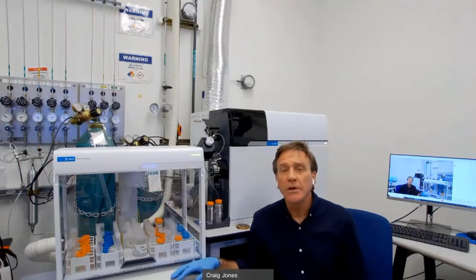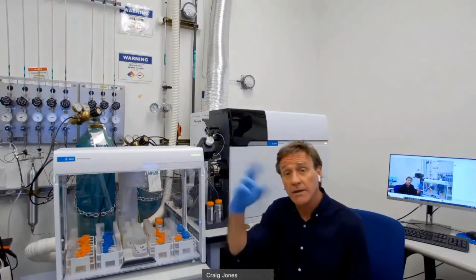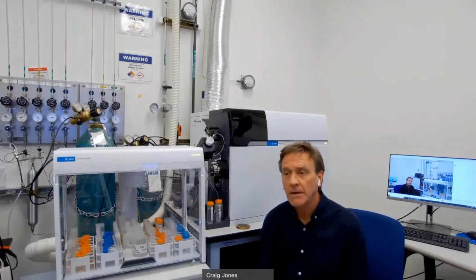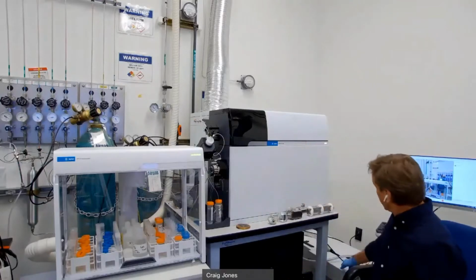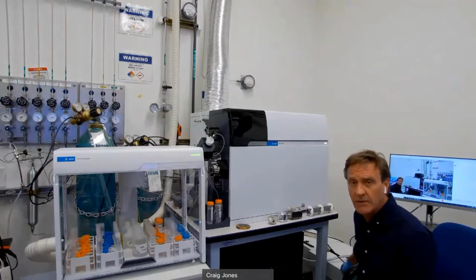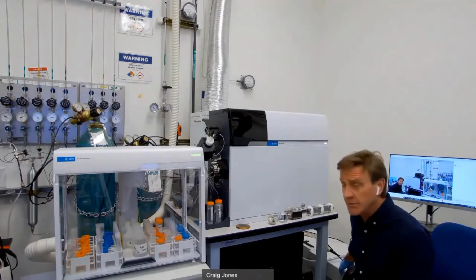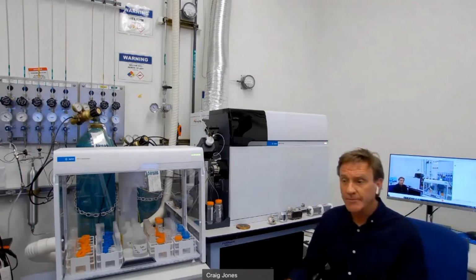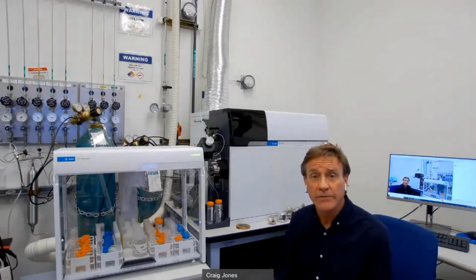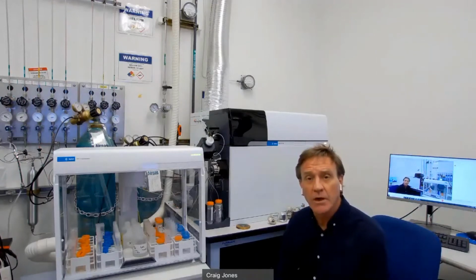We do need to use a chiller, and the chiller, if you can see those gray lines that go up in the back, is located in a room next door, just to minimize the heat and the noise that it can contribute to the laboratory as well. Down here to my right is where the rough pump is located, and that rough pump is actually in an enclosure, to help reduce the noise as well. We like to have the rough pump close to the system, so that's why it's located right next to the instrument. Cell gases are located behind the instrument. Some of them are located in the room next door, and that's pretty much all you need. The argon, of course, we've got a bulk argon system, and that's located down the hall.